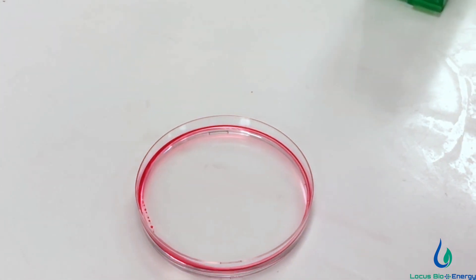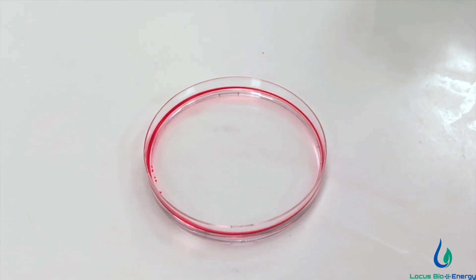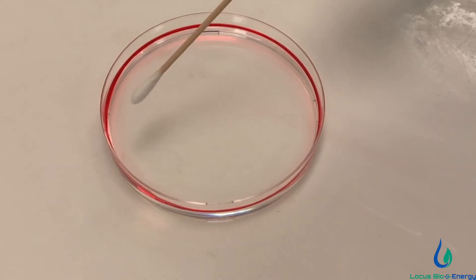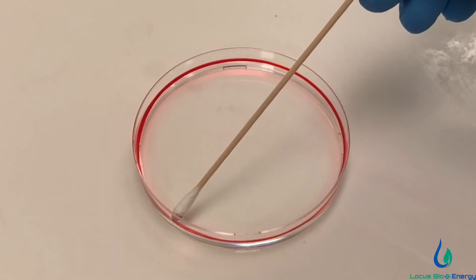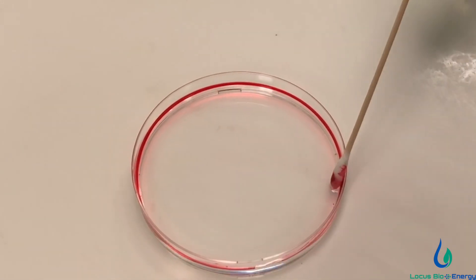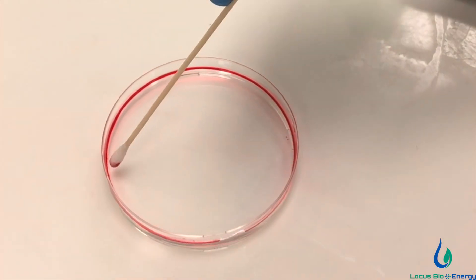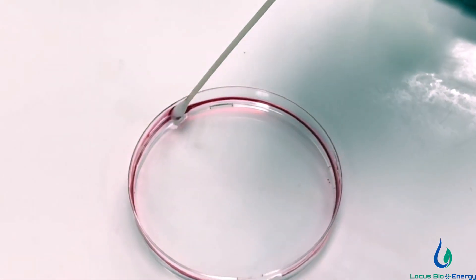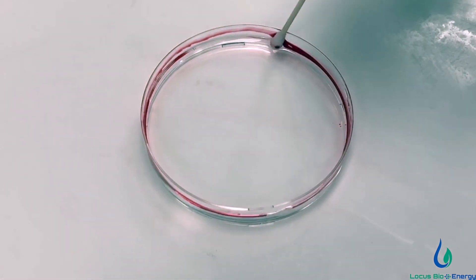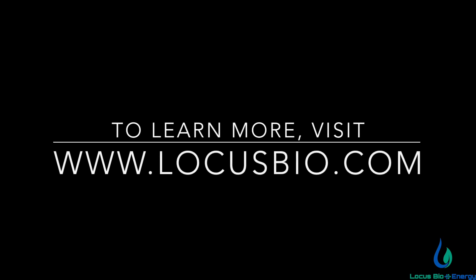You could see the effect of a minute quantity of the biosurfactant almost instantaneously displacing the oil and making it go towards the edge. You could collect the oil from the edges of the petri dish now because of the way the interfacial tension has been changed. From a practical standpoint, this shows the ability of the biosurfactant to penetrate far deeper than is possible without its use.